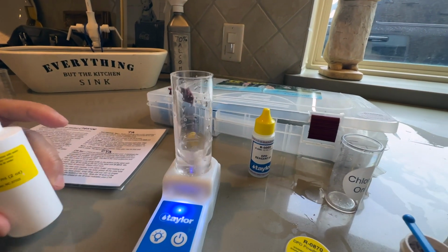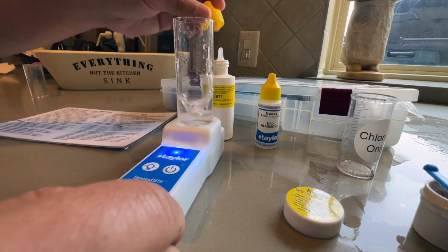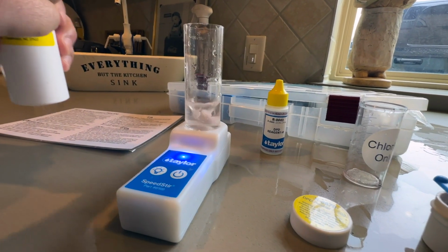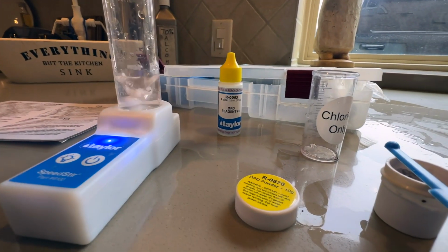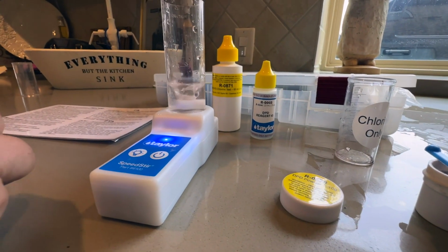So it took 3 drops for my water to be clear, and the formula is you just divide that by 2. So 3 divided by 2 is 1.5, which means that I have a 1.5 parts per million chlorine level in my tap water.